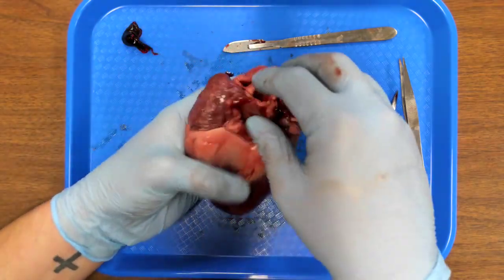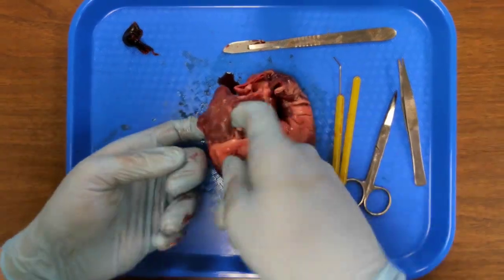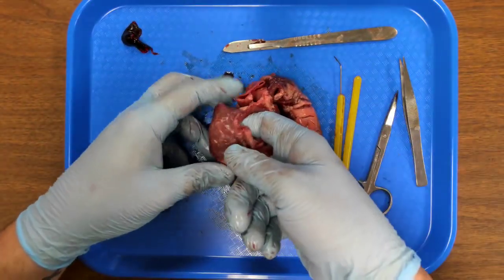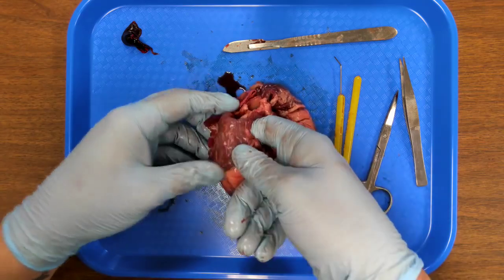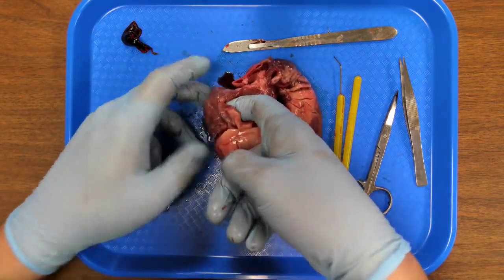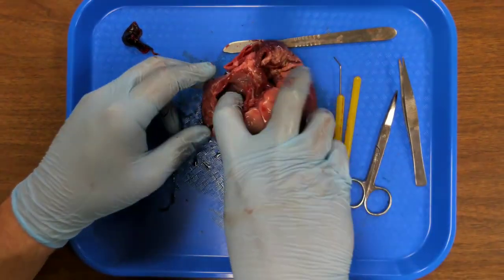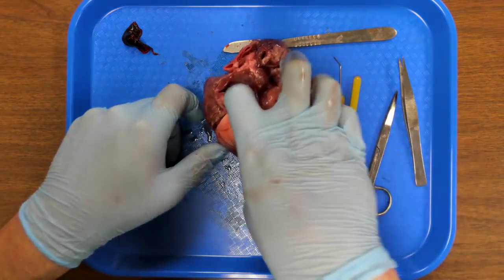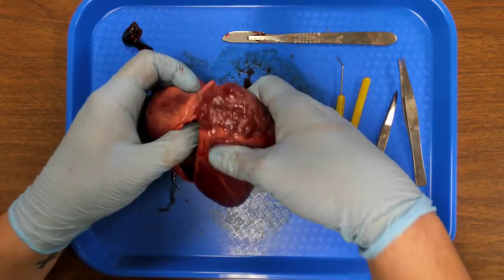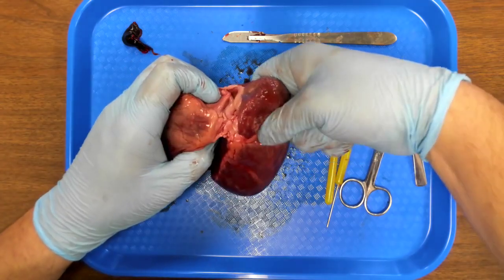I'm going to flip it over. It comes back to the heart around the backside here into the left side here, the left atrium. So this is the pulmonary vein. Takes oxygenated or oxygen-rich blood back into the heart. And now we are inside the left atrium.